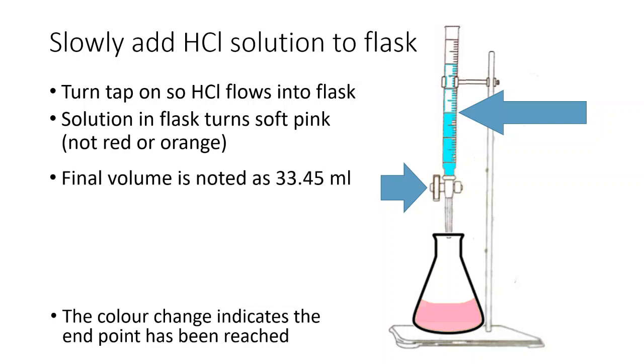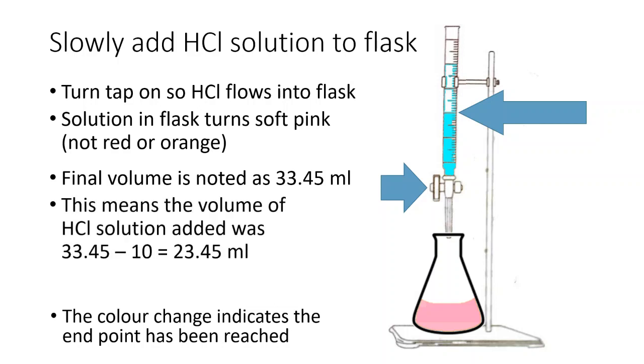And I obtain that final reading, which is 33.45 mL. I get the difference between the two readings, final minus initial, and that's 23.45 millilitres. That's the amount of hydrochloric acid solution that was added. And so the titre is said to be 23.45 millilitres.